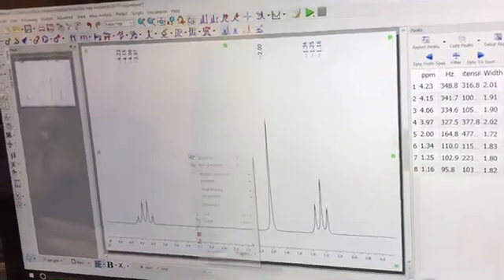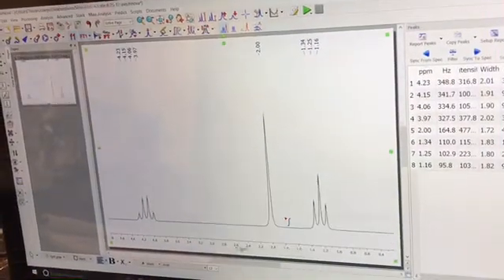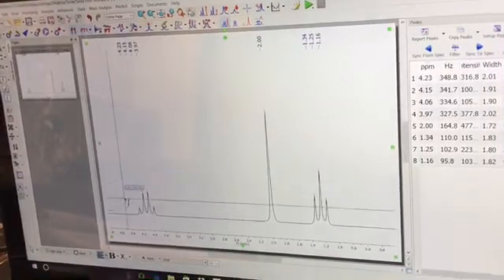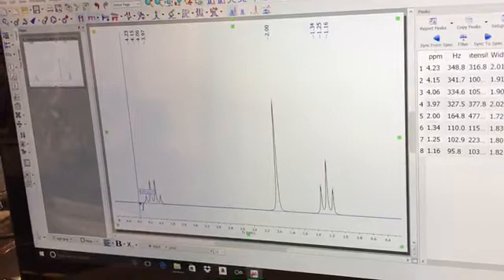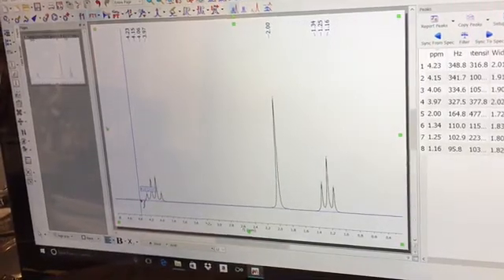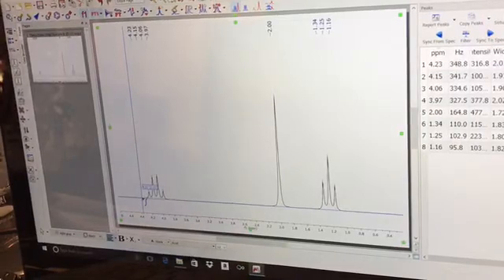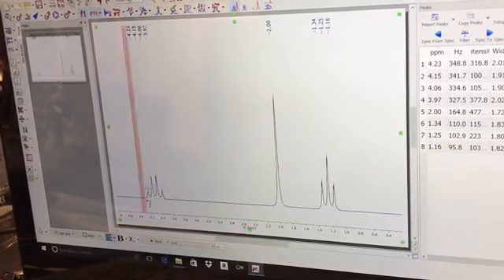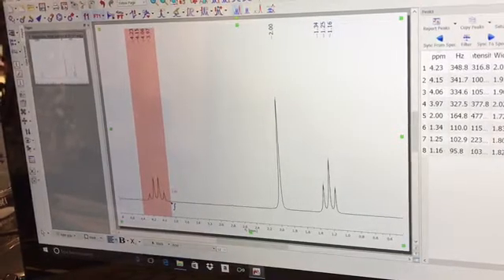The next thing you want to do is right-click, go down to Integration, and click on Manual. From there, you're going to place the crosshairs right on the baseline to the left of a peak where the line is totally flat, click, and drag to the other side, and end where the baseline is also flat.